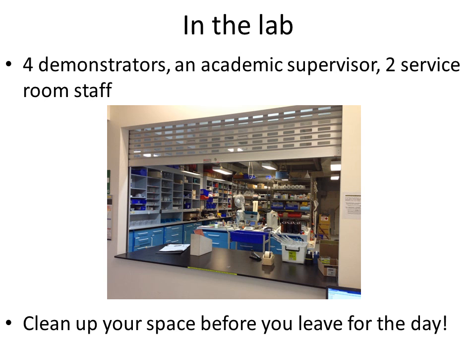You must clean up your lab space before you leave. Leave it looking the same as when you came in. Students the next day will be using the same equipment and glassware as you, so you need to make sure that things are neat and tidy for the next lot of students. If you leave without cleaning up, you may be penalised 10% of your mark for the day.